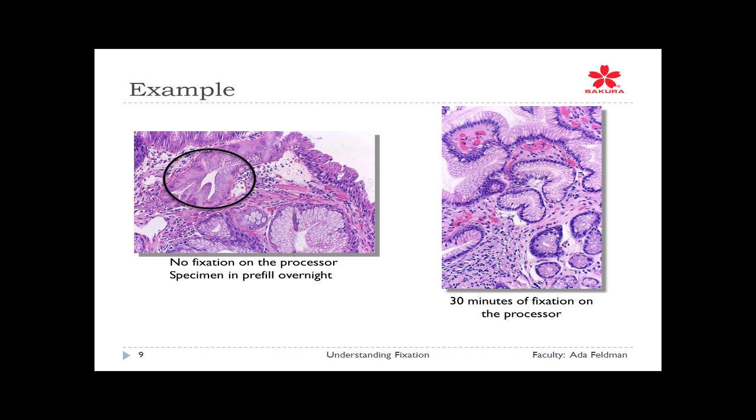I asked her just to put fixative on the tissue processor, and she immediately said she had no extra time, could not afford to put time on. So by taking a look at the multiple alcohols she had, we came to the conclusion that we could steal one of the alcohols and just give the processor one 30-minute fixative station. And that's what you're seeing on the right. She immediately, by having that freshness of fixative, now true, she still was using the buffered zinc formalin, she lost all of that washed out. I mean, she actually got cell membranes popped.